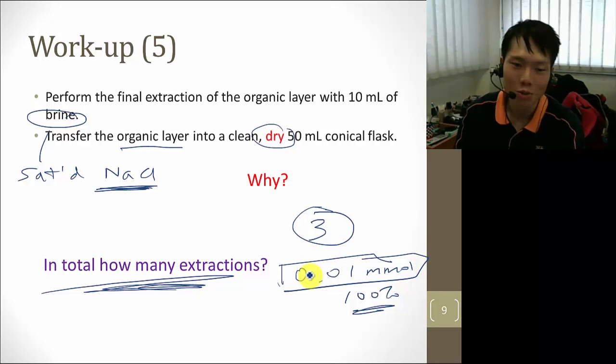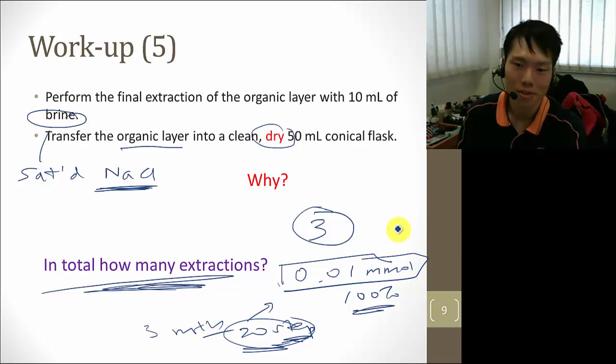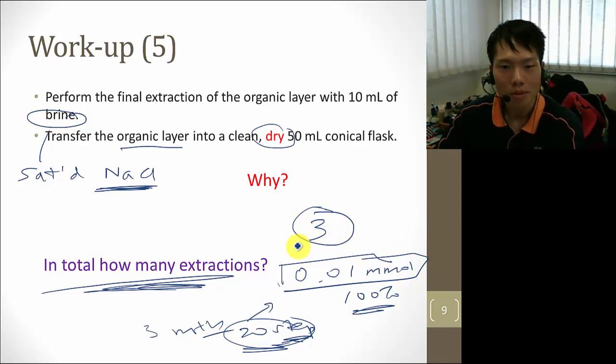You don't want to lose any single bit out because it's so rare. After like a 20-step reaction, I want to savor and collect as much as we can, because maybe this took you 3 months to make. You get me? Okay, but in this experiment, 3 is good enough. Alright? Watch the video first and get yourself familiarized with it. Pretty clear, go through in your mind what's going to happen before you embark on the experimental procedure.